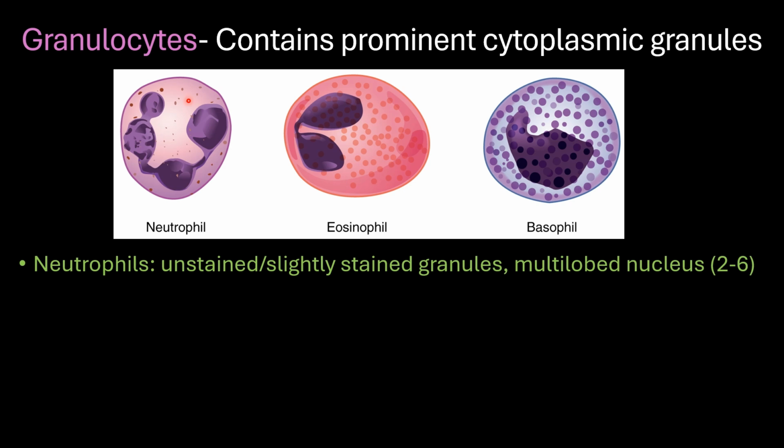The key thing about neutrophils is their nucleus here is multi-lobed. So we see 1, 2, 3, and 4 lobes in this one. It can vary from 2 to 6, with 3 lobes being the most common, but we can also see some with uncommonly 5 and rarely 6 lobes. Unfortunately, immature band neutrophils can be observed in peripheral blood, where instead of having these lobes right here, it's more horseshoe shaped and not quite as lobed.